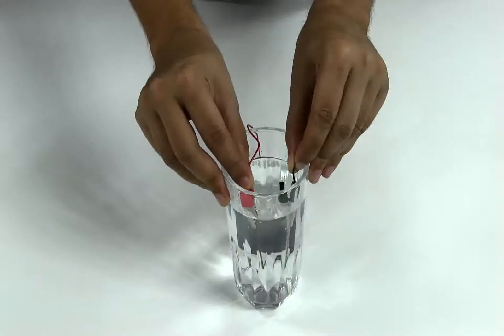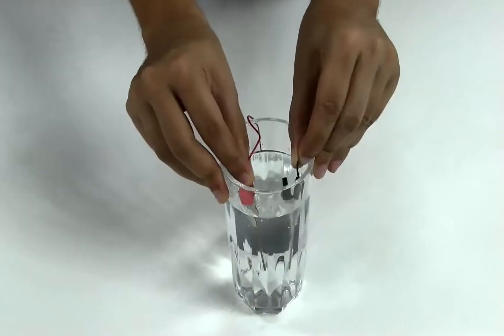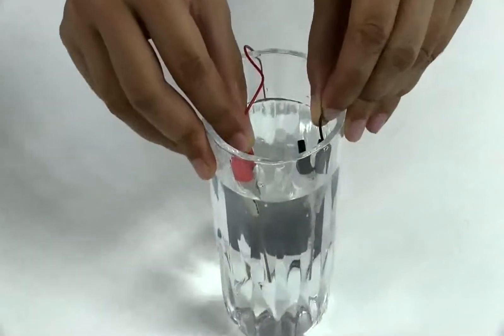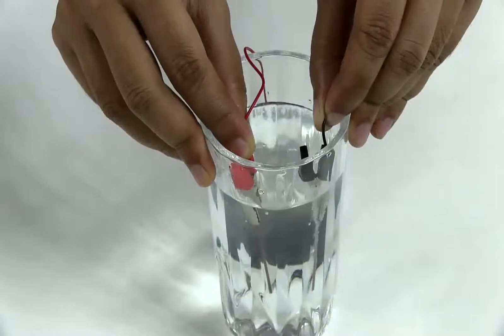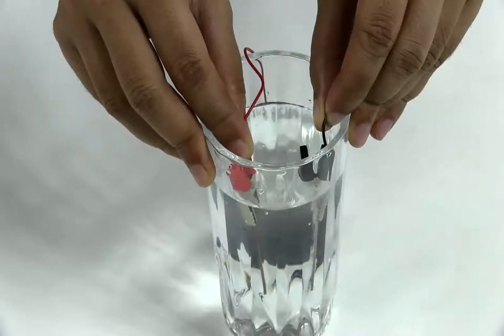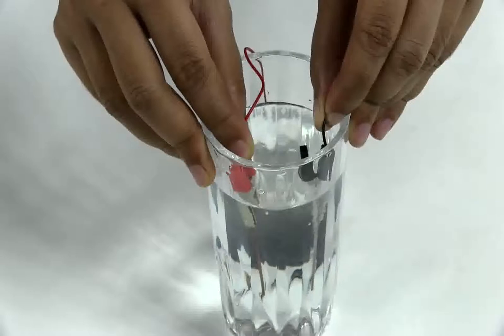At the negative end of the battery, these are hydrogen gas bubbles. At the other end, you can see that some greenish-yellow substance is forming up.